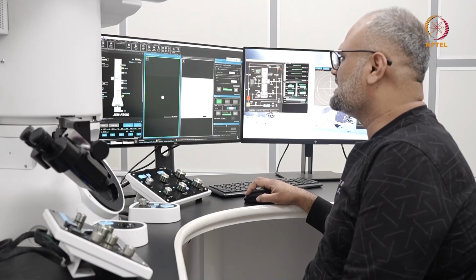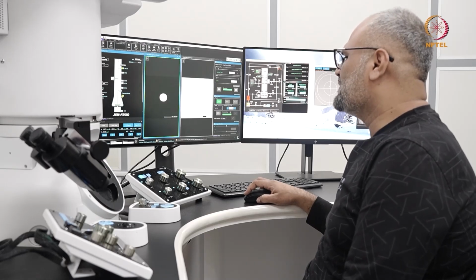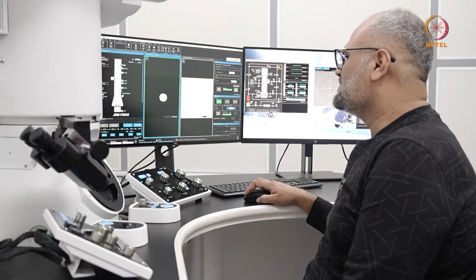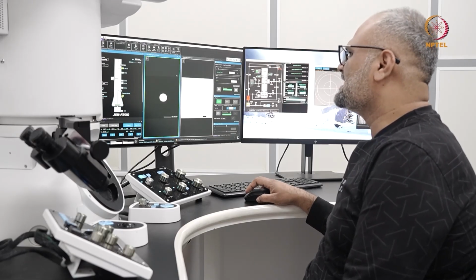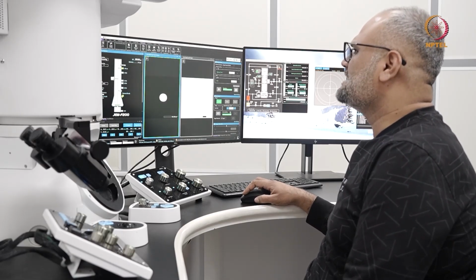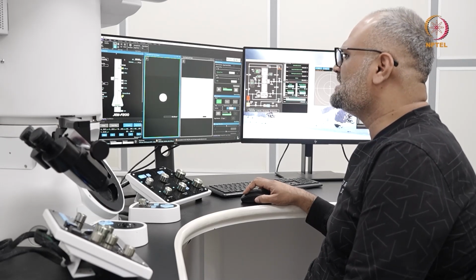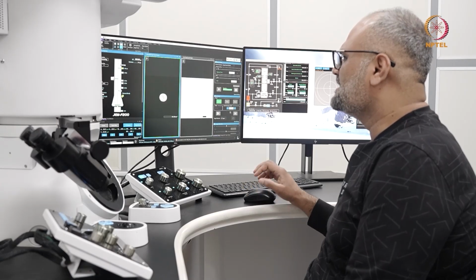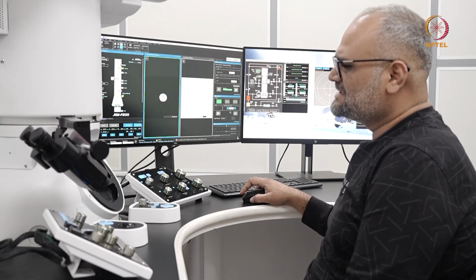So if I retract the detector, I'm essentially allowing the electron beam to form a probe, and I'm continuously rastering. It is now being rastered here. If I say scan stop and go to a spot mode, you see that there is a slight displacement of the beam here. This would stop right now. So as you can see, the image from the grid is here.